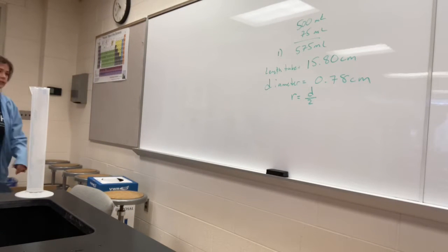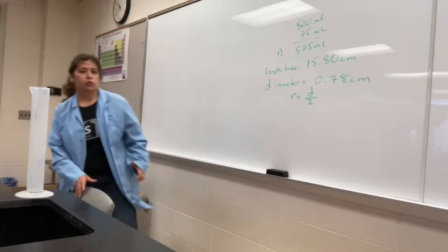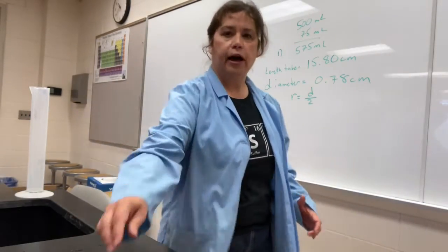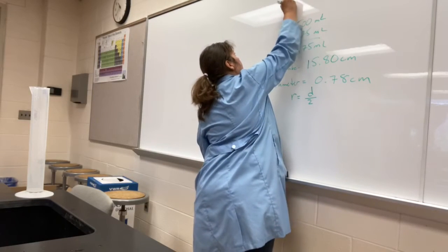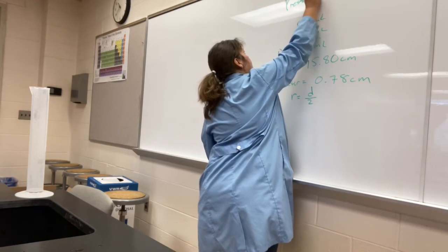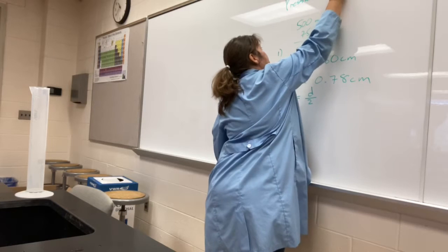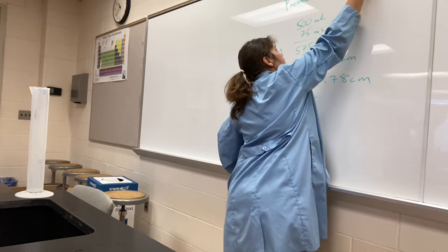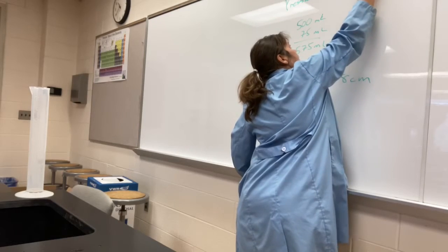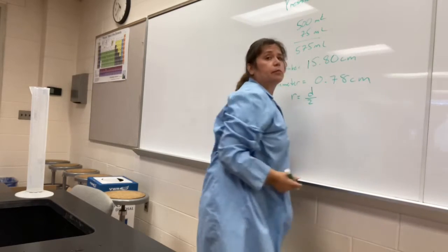It says the atmospheric pressure is 29.59 inches of mercury. Now that's inches, and it's also measured in mercury as our liquid. And that's going to have some implications for us.